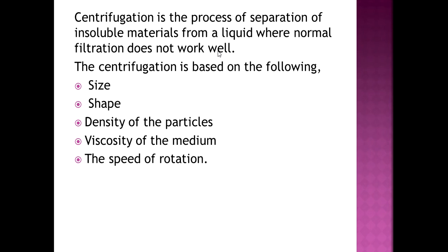Centrifugation is based on the following principles, and these are the basic principles that are followed when you carry out the centrifugation process. The first one is the size of the particles. During centrifugation, larger particles always settle out first, followed by the smaller ones.